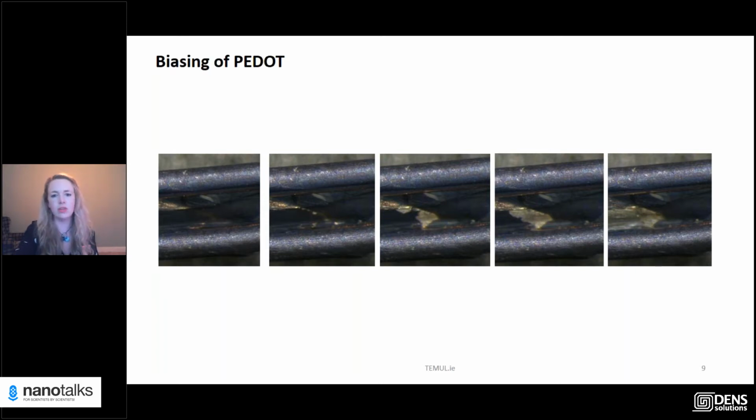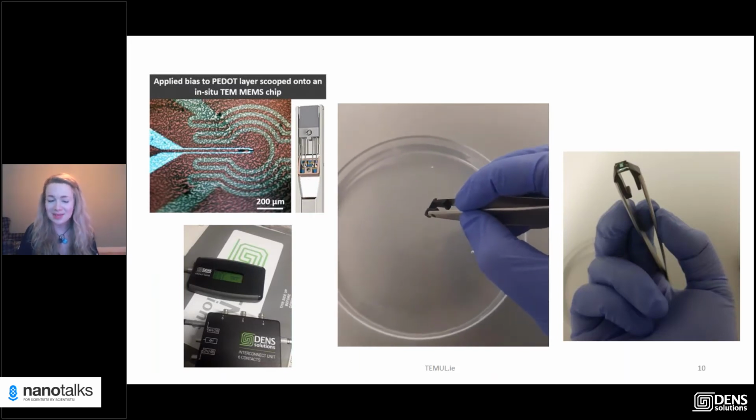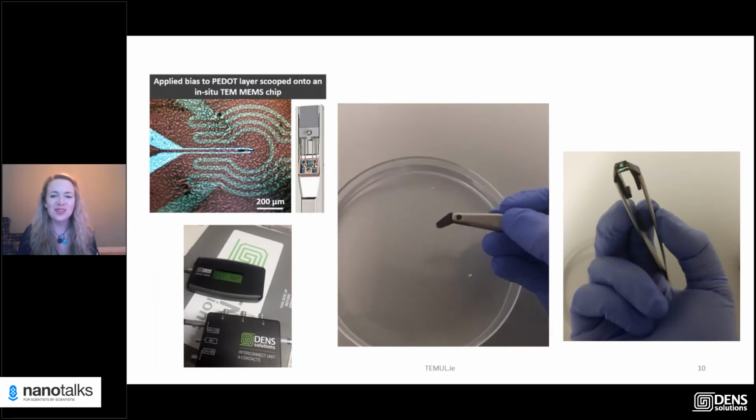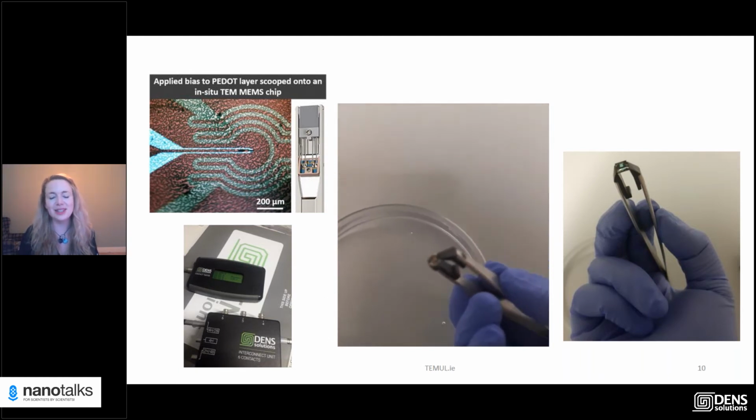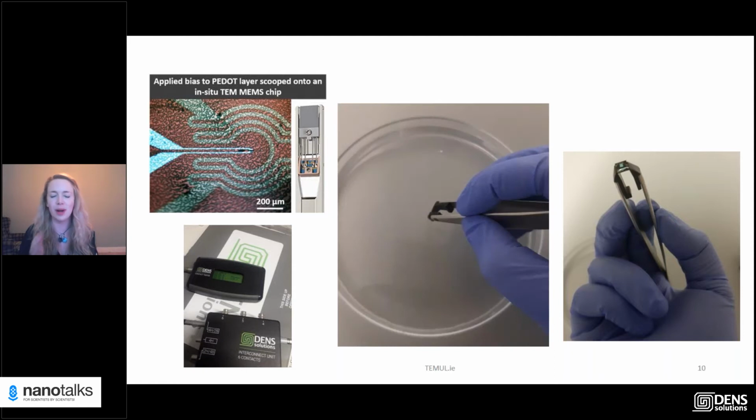So we said, okay, this is really great, but we're at the light microscopy resolution, and also we can't really understand what's happening structurally. We can just visually see there's something changing. So we went to in situ biasing. And using what we call now, Rob Lahan, who is in Michele's group, we tried all these different methods to get the polymer down. So in the second part of the talk, I'll talk about how to make FIB lamella, but this is an amorphous polymer. I cannot FIB this, otherwise I will destroy the material. So do the little video again, hopefully.